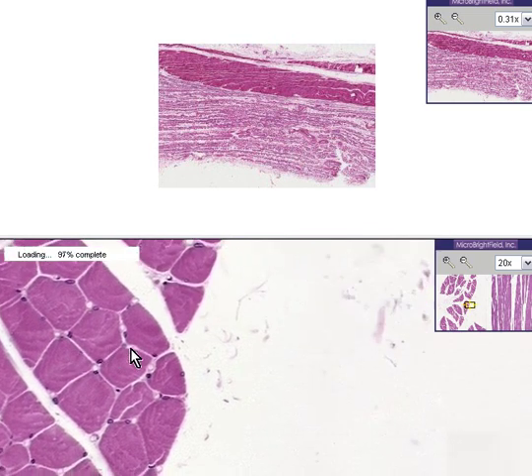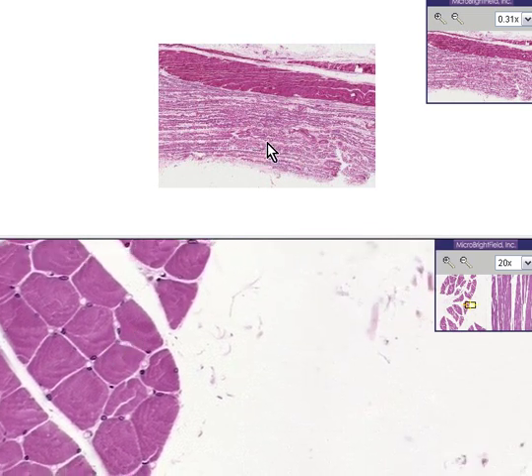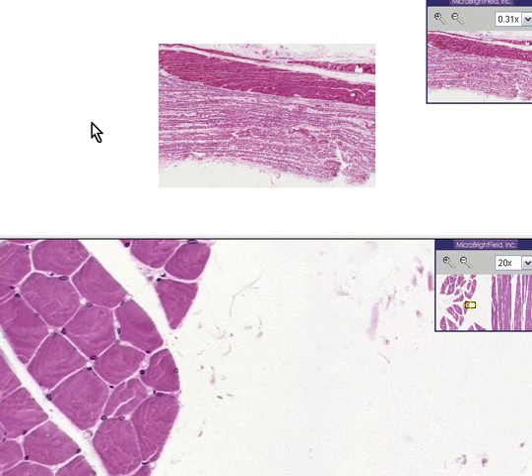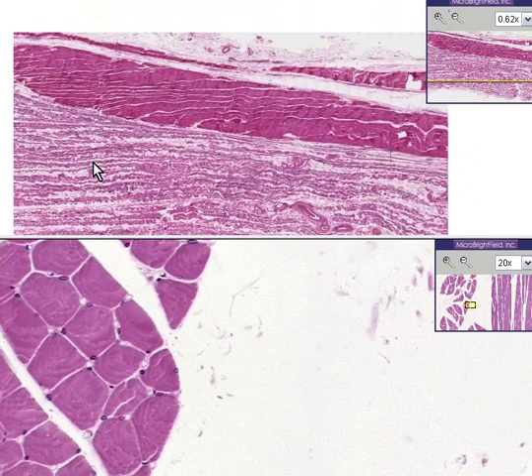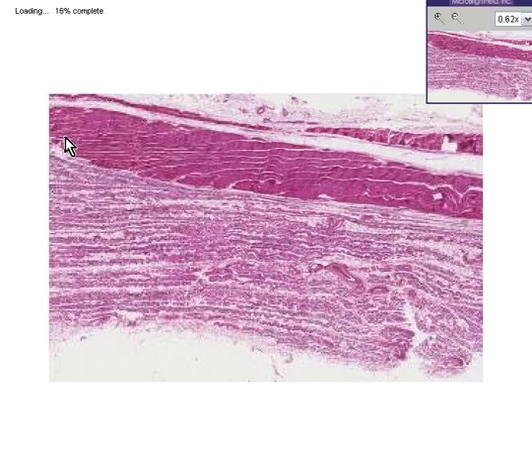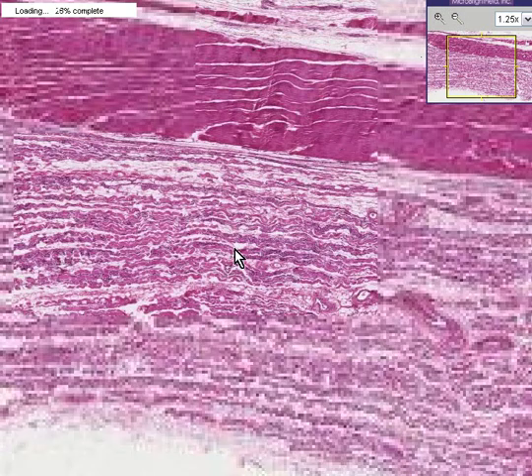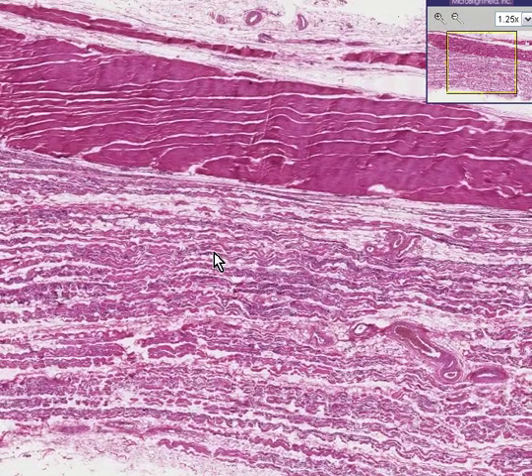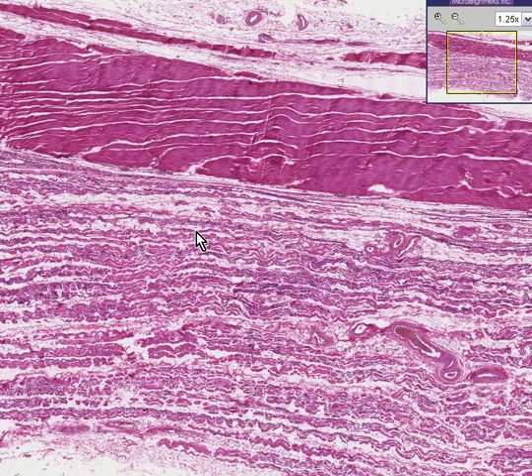This is a textbook normal skeletal muscle fiber. What happens when skeletal muscle loses its innervation is that several things happen to the fibers: they become smaller, they generally start accumulating fat between them, and of course they die.